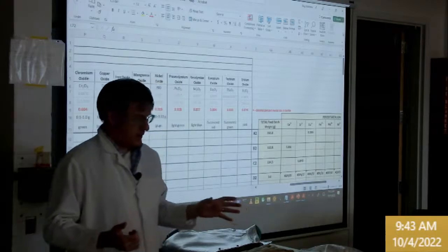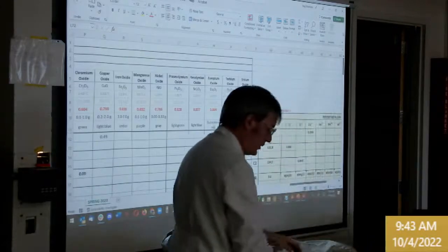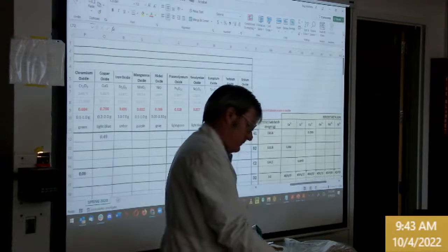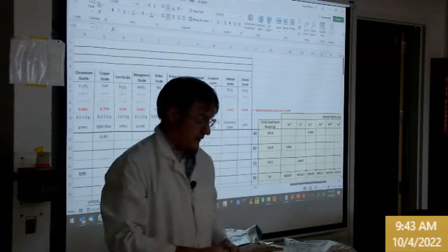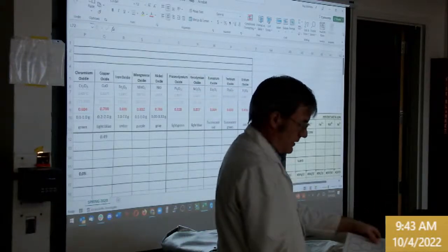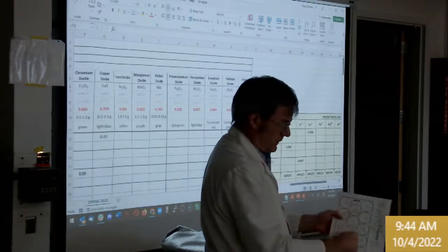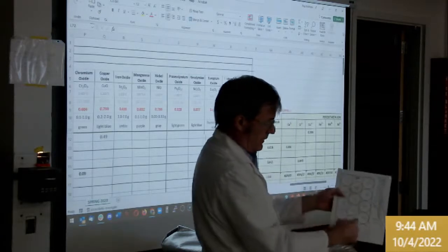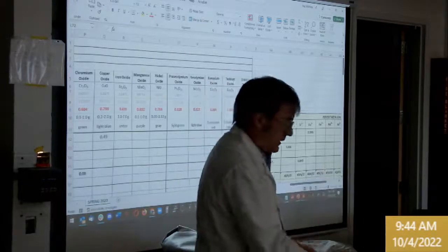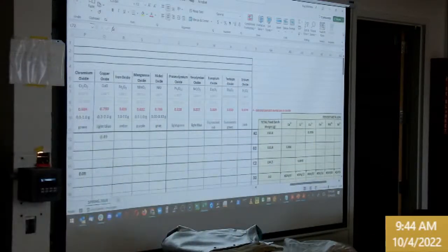So the workflow is, I'll have the batch records over here, and I'm gonna call out what each batch is made out of. So I'll need somebody to just be here looking at the load diagram for the furnace so that I'm coordinated on which batch I'm pulling out. You just start A, B, C, D, E, F, G, H, I, J, K. So that's one job. The second job is someone to do the door duty.